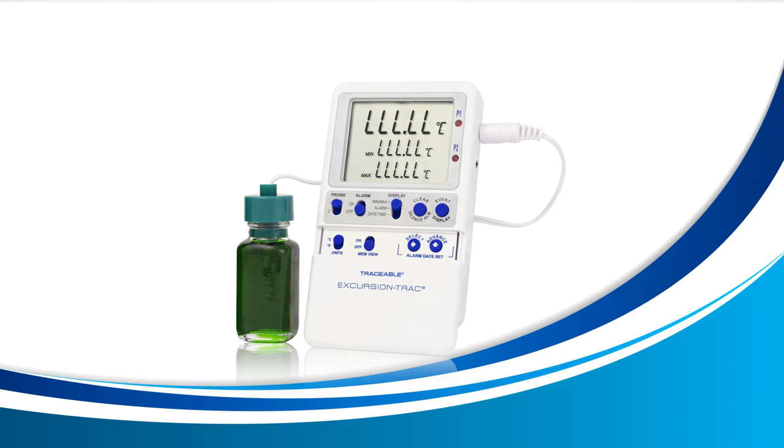If these three remedies don't remove the LLL.LL error, unfortunately this means that your probe could be damaged. Please contact us directly and we will help you resolve this issue.